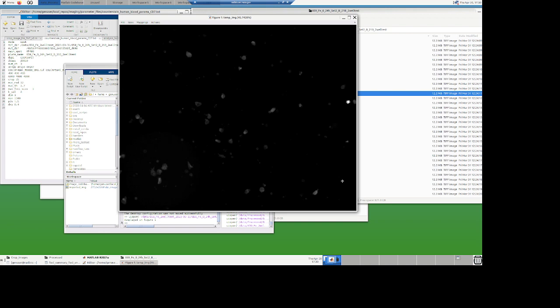Voila. I pick this kind of by trial and error. I typically run the script once and see how things look. I load the images to have an idea of how intense they are. So I put my mouse on this and see the intensity here, and that gives me a good visual.